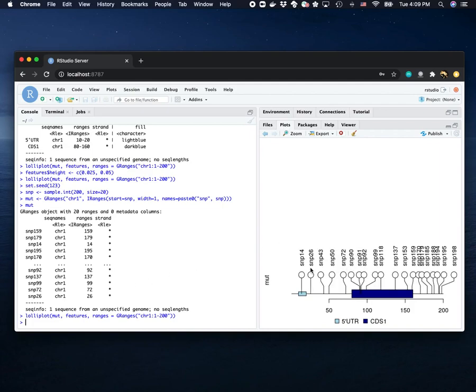We can see it's a little busy here, and we assign the score by random number. We set it as 10 because we assign the size total is 20. We also say keep same here.